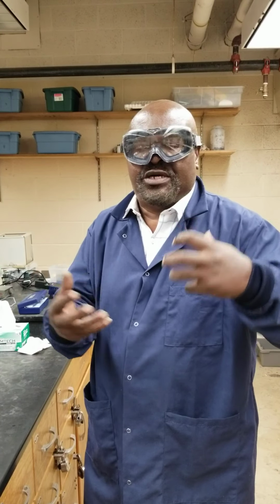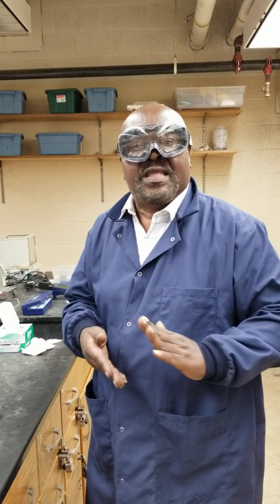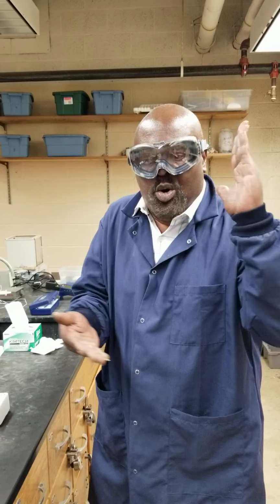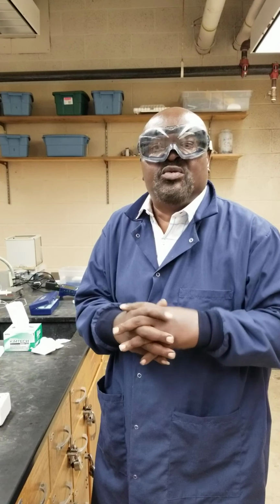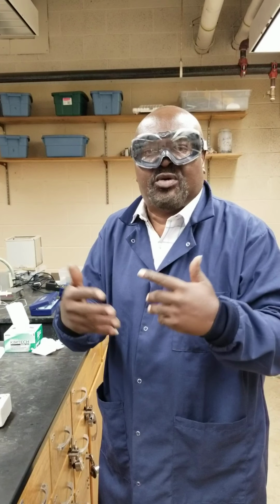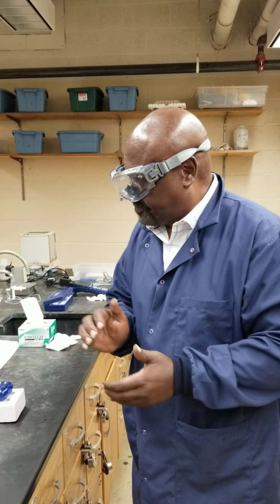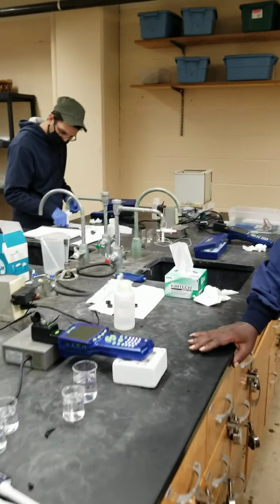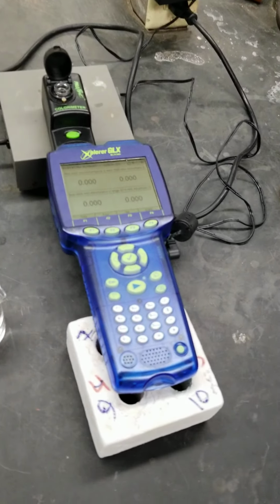So if we make a calibration graph for absorbance versus known concentrations, then we can use that to determine concentration for the amount. All right, so here is our colorimeter, a color intensity measuring device.